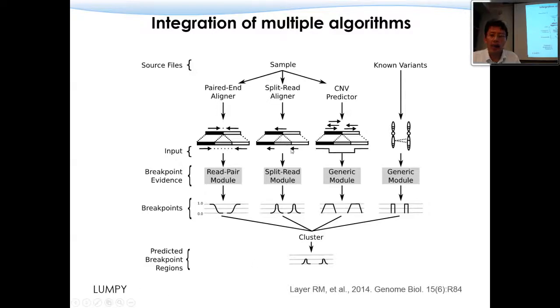And what happens is it basically integrated all this information together, using the information we discussed in the earlier slides. So this is pretty much the gold standard of doing structure variation identification. Of course, newer ones continue to come out for this type of work. Okay, any questions? So what does breakpoints just mean overlapping reads?